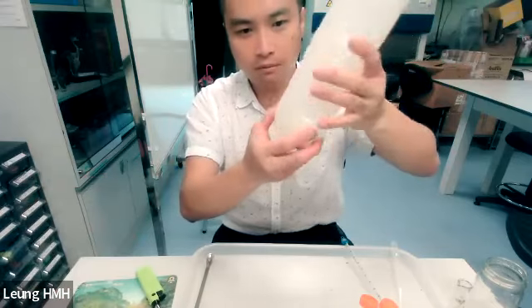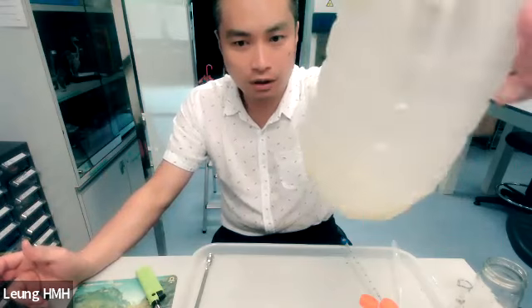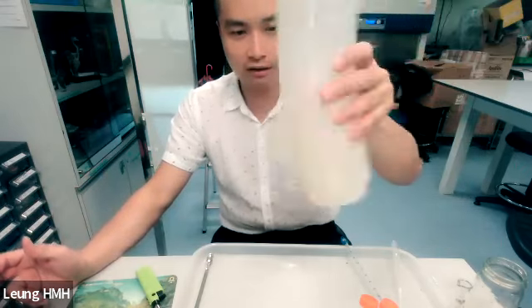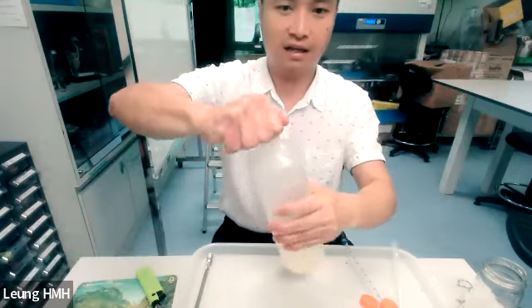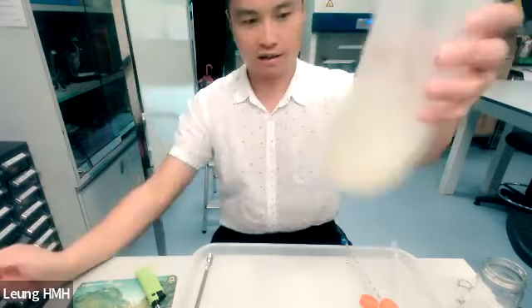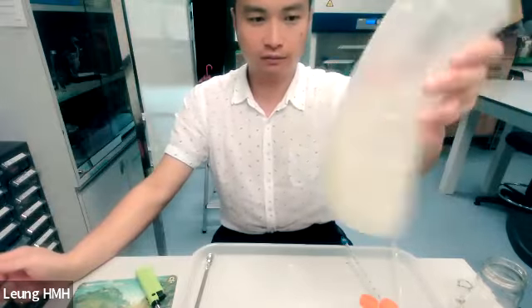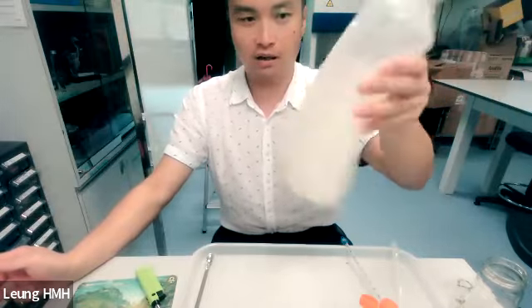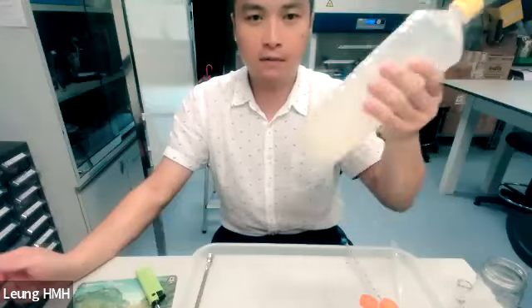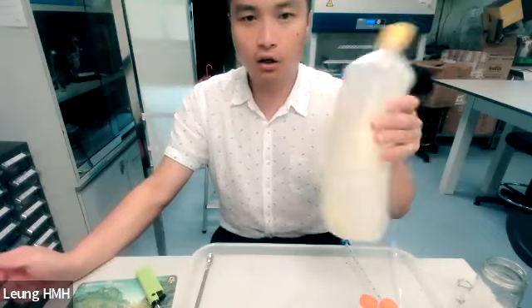Okay, during this time you need to observe the changes of the layer. Release the gas. Okay, and then we go back to this. Shake it, right? Shake it rigorously, actually.